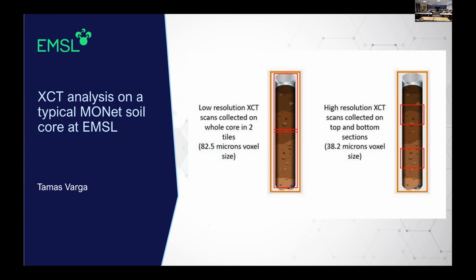Do we have any plans to improve the spatial resolution for XCT through partnerships? Yes, that's right. We are partnering with synchrotron light sources such as the Advanced Photon Source, where they have great micro CT capabilities to do imaging at micro resolution.